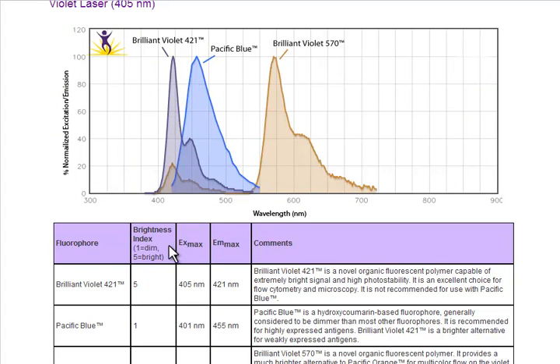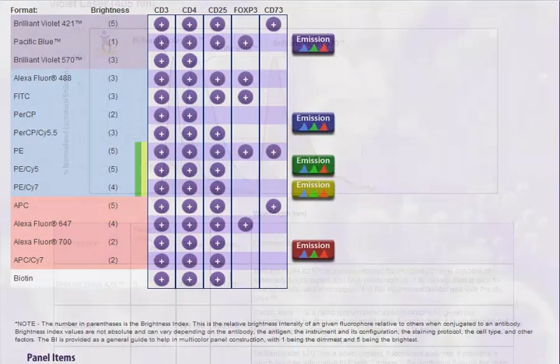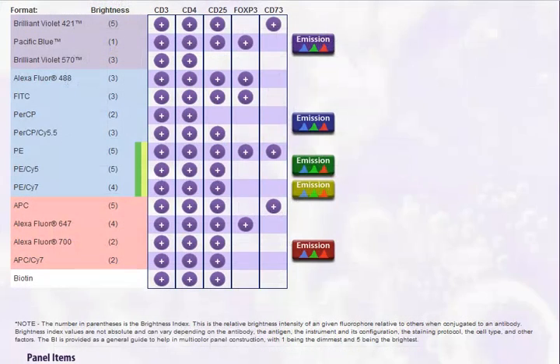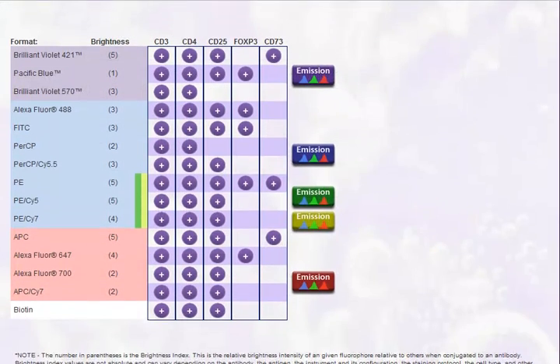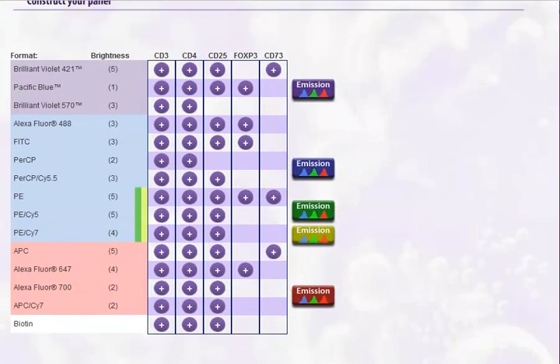In the window, you can find emission spectra, brightness index values, excitation and emission maximums, and general comments on each fluorophore.